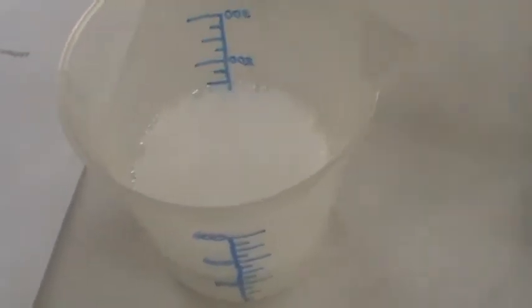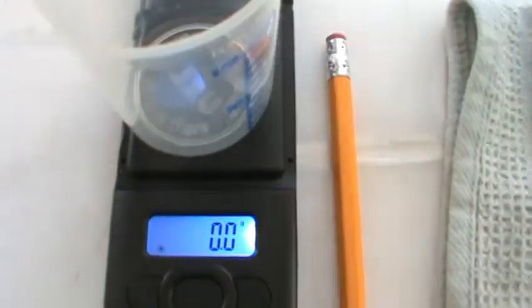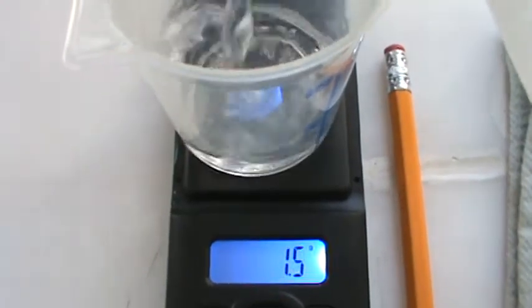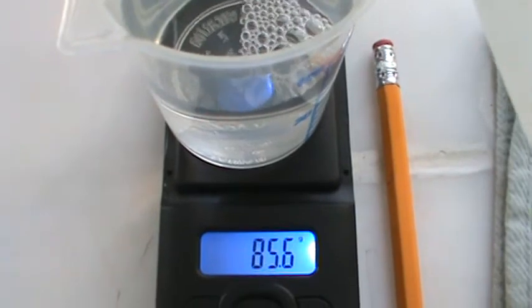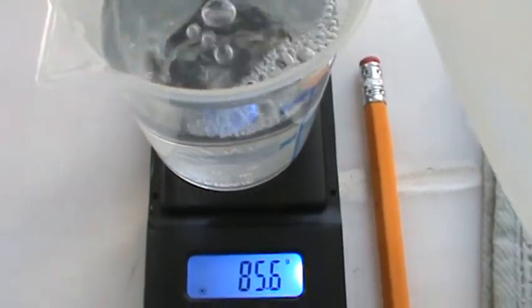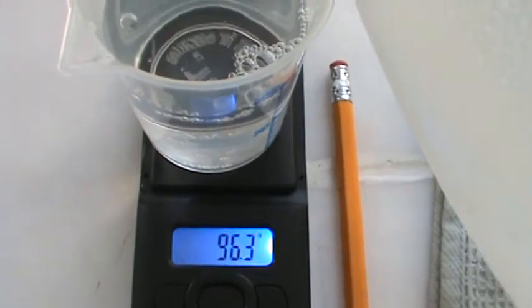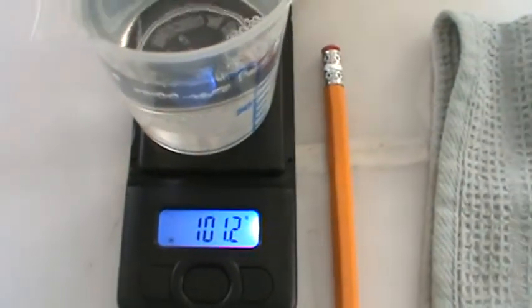Now we remember that that was only about half the vinegar. So let me come over here and measure out the 100 that I need to go with that 96. Technically 99.8. Oop, okay, that was too much.